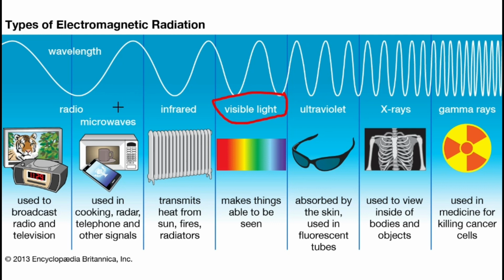Hindi naman po tayo nakakakita ng waves ng microwave. Di rin naman natin nakikita yung UV rays or X-ray, di ba? Yung mga waves coming from those materials. So again, only those under the visible light can be seen with our eyes.